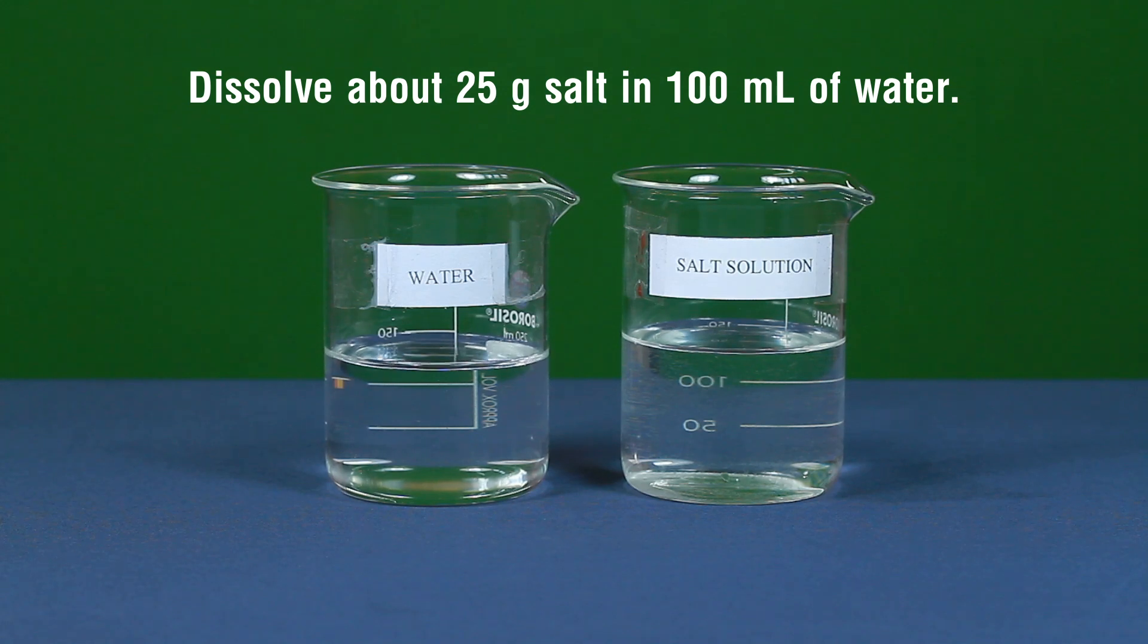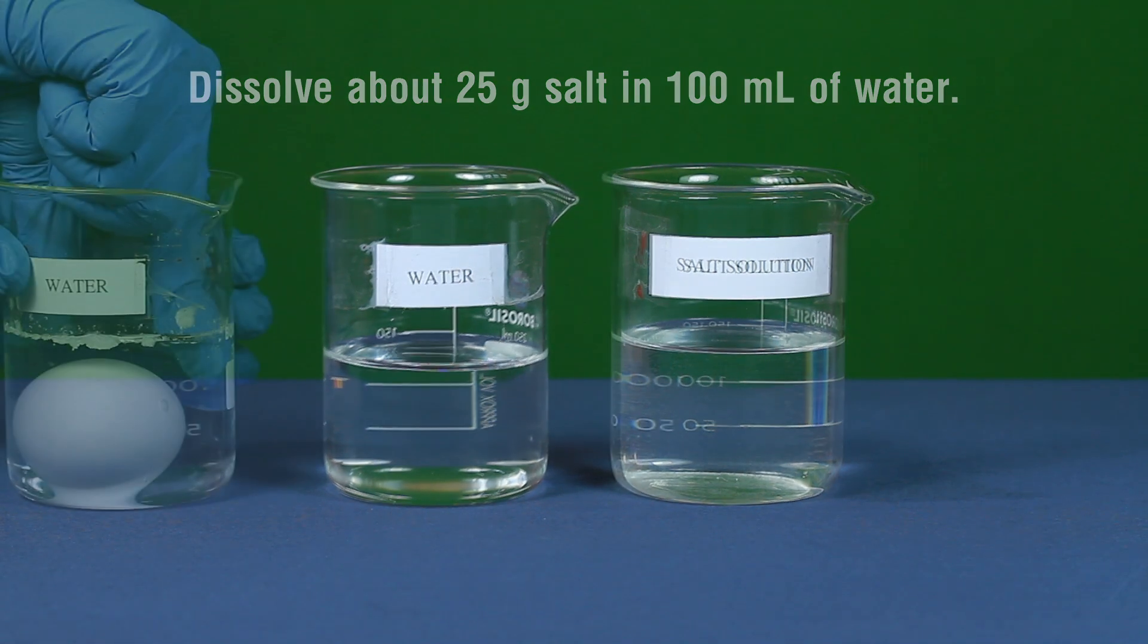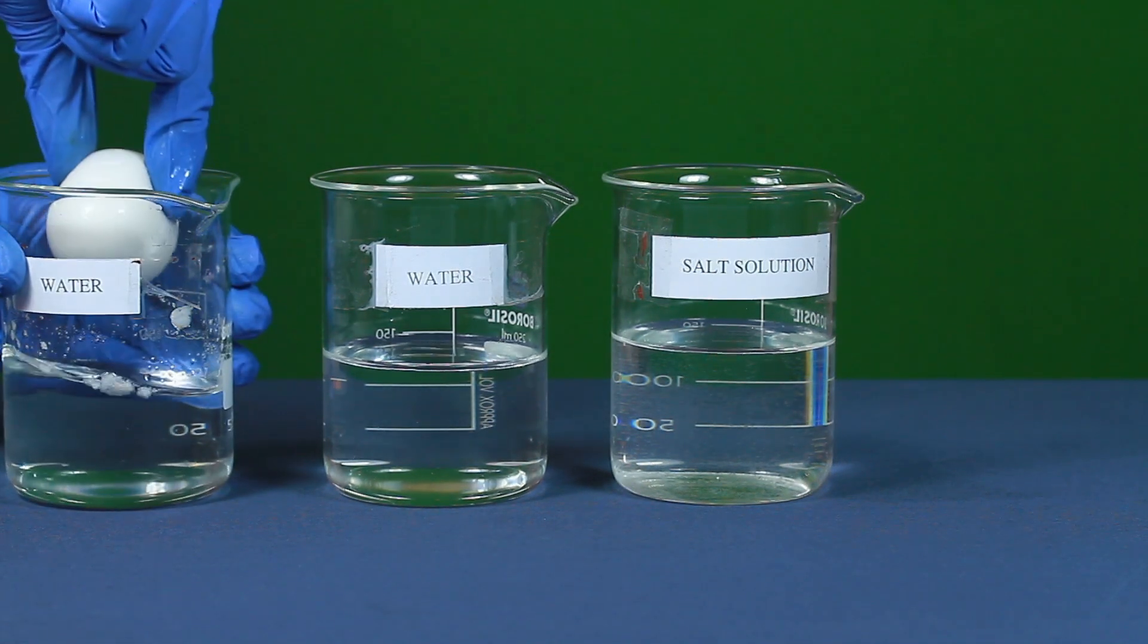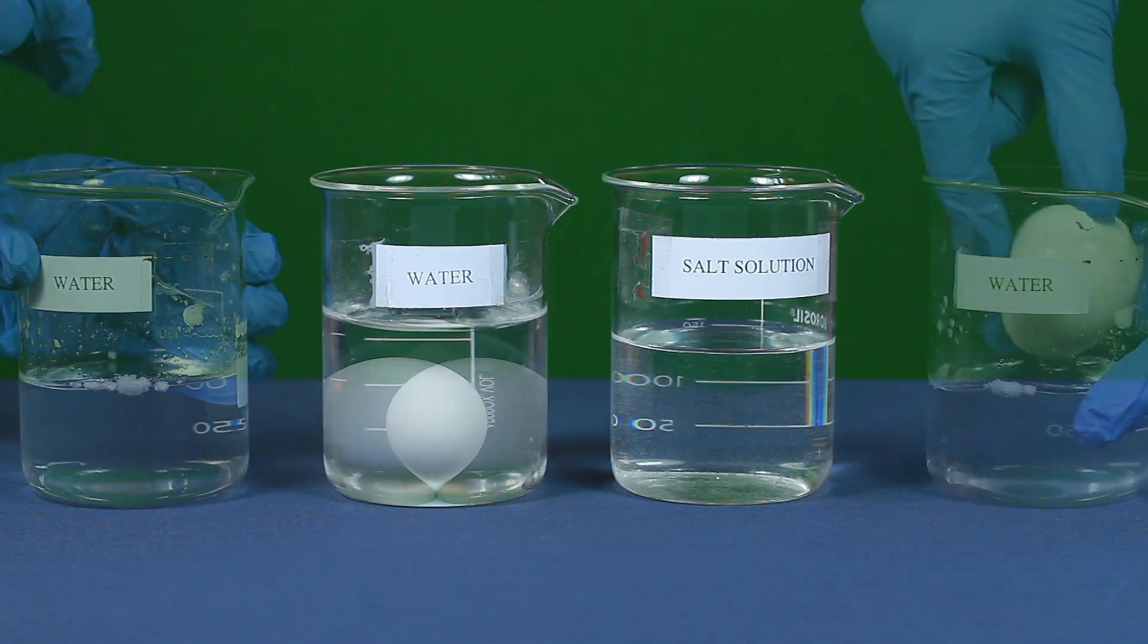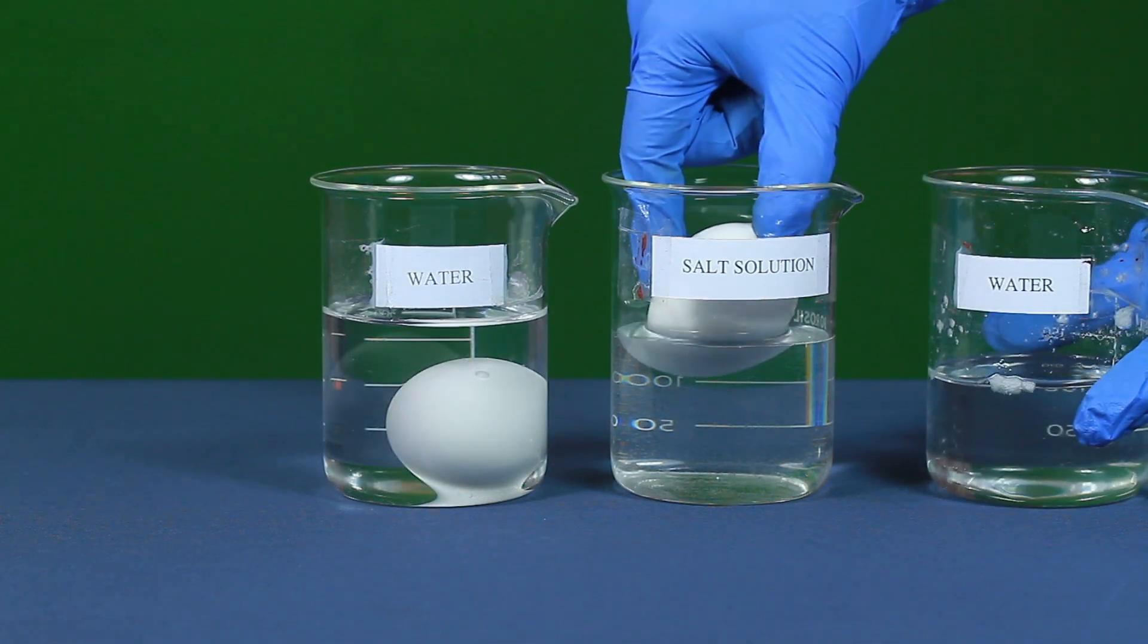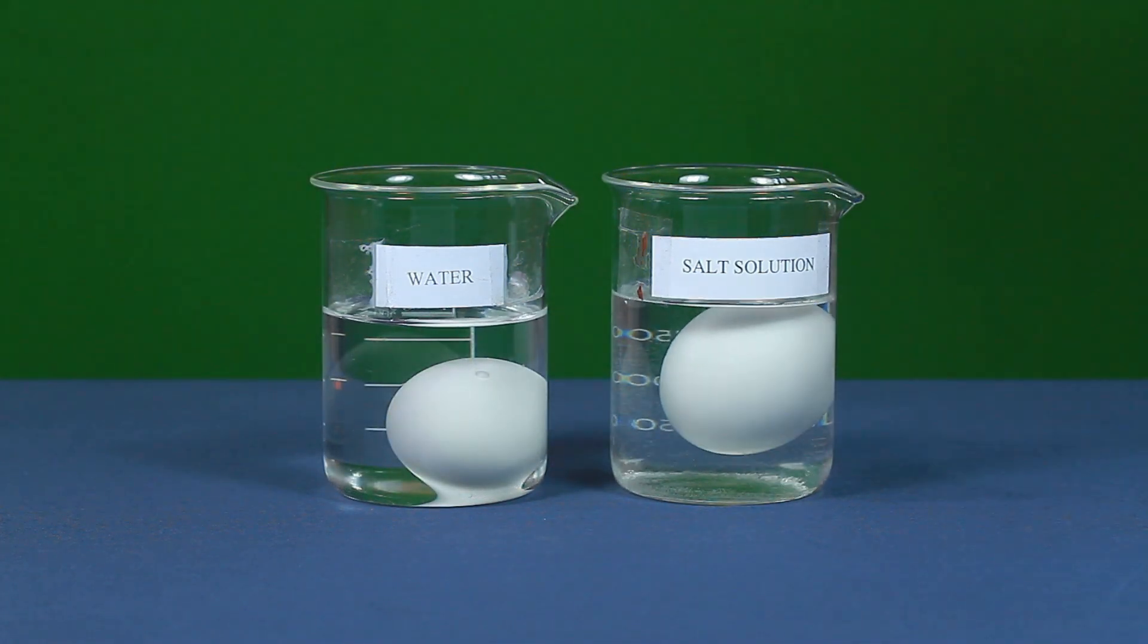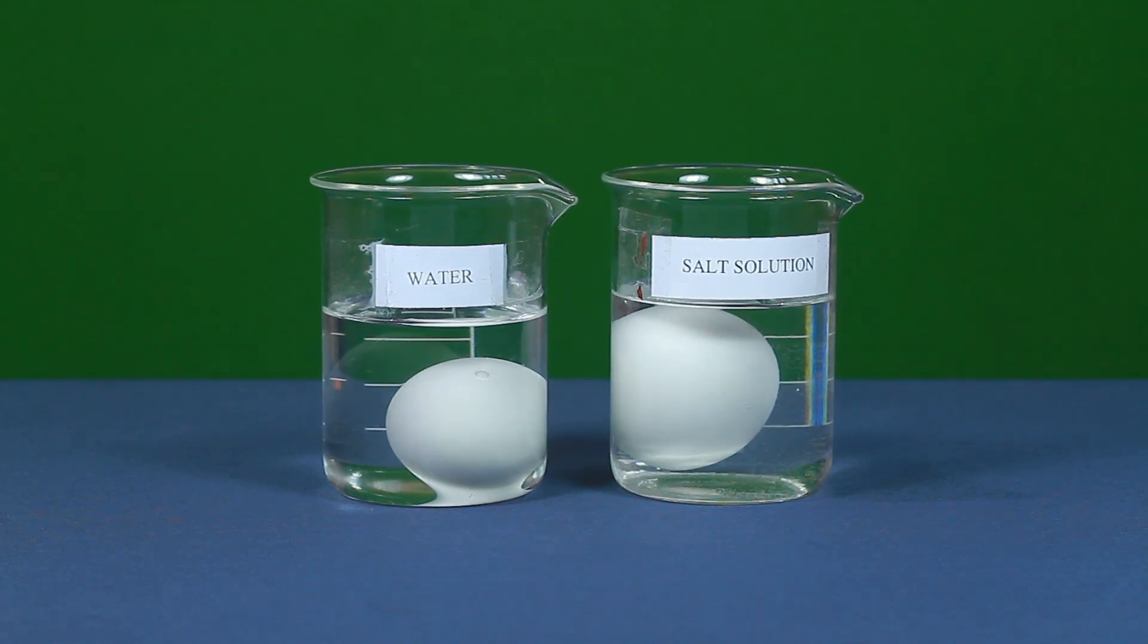Take one beaker containing water and the other beaker containing salt solution. Drop one of the de-shelled eggs into the beaker filled with water and the other into the solution of concentrated salt. Leave the setup for about four hours and observe the two de-shelled eggs.